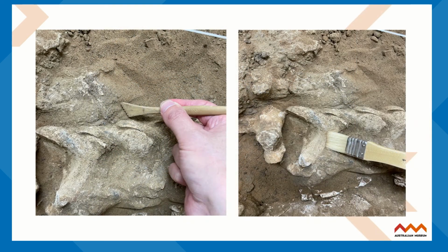So we have made a start on the excavation, but had to step away from on-site work for the time being. I have begun uncovering the vertebra bones as these seem the best preserved and a good place to start. I've been using wooden hand tools to break the soil surrounding the bones and then brush it away. So some of the brushes I use are quite stiff to help break up the soil, but others are much softer for use on the bone surface so that I don't actually damage any of those fragile exposed areas.